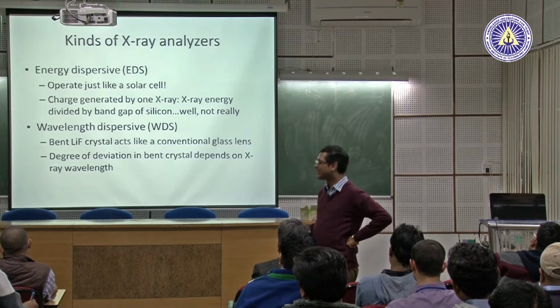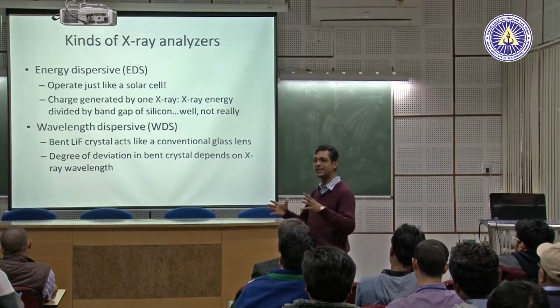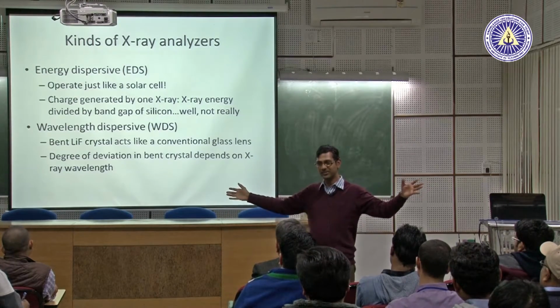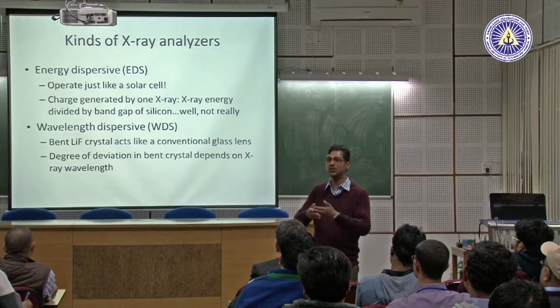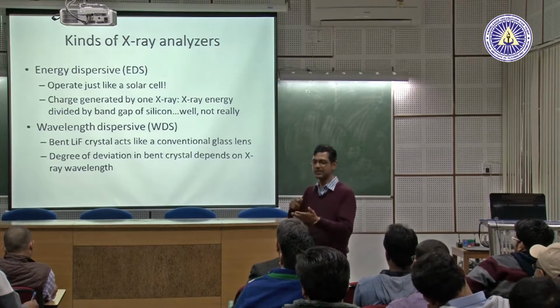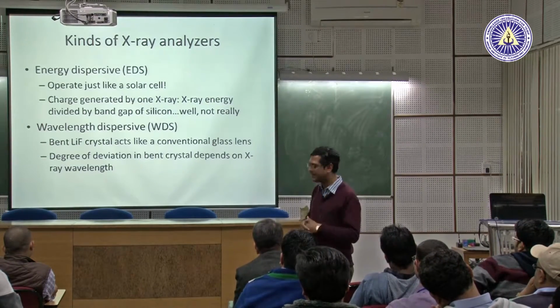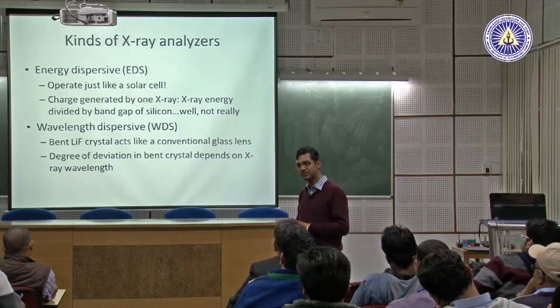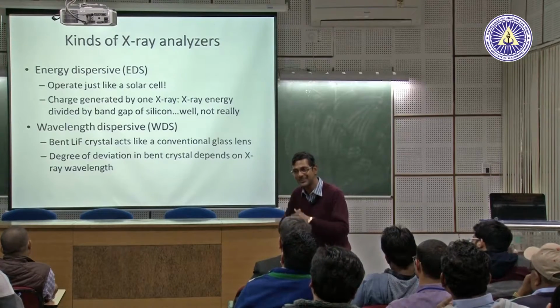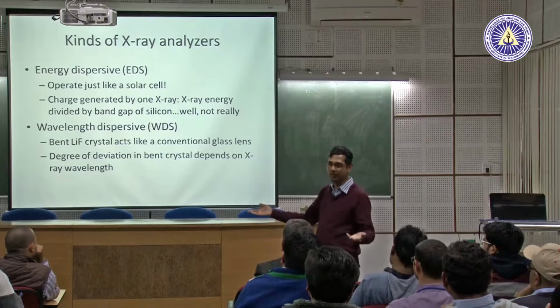Yes. Let me explain this. This technique relies on Bragg's law. You generate all kinds of X-rays by bombardment. Suppose your sample contains 10 elements: oxygen, carbon, aluminum, copper, nickel, barium, titanium, and each will generate X-rays because of bombardment of electrons. Each one has characteristic wavelengths because of energy. Energies are fixed and related to wavelengths.